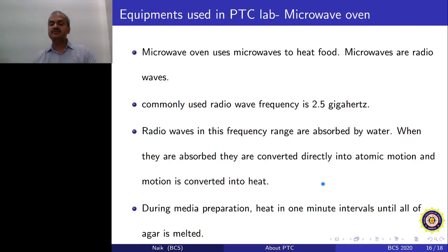The beakers generally get reasonably hot, so you should not hold them with bare hands. You should wear gloves or handle them with some kind of cloth, and then pour that agar into a beaker that you can handle, to pour the media into test tubes or conical flasks. So don't pour this media directly. If you have prepared 500 milliliters or 1 liter of media in a 2 liter beaker, you should not pour it directly, because it is hot and one cannot hold that entire 1 liter beaker in a normal hand.